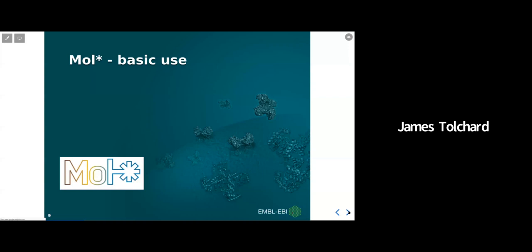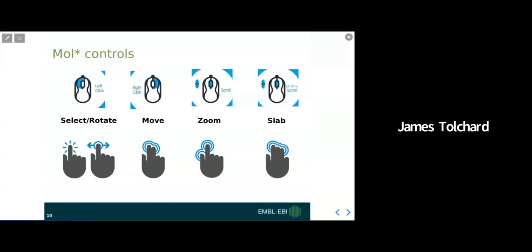Now we'll look at the basic usage of MolStar and show you how to load a structure directly from a PDBE entry page. Let's briefly run through the controls. To select and rotate molecules, simply left click and drag, or one finger hold and drag. To move or translate a selection, just right click and drag or two finger hold and drag. To zoom in on a selection, either use the scroll wheel or two finger pinch. And for slabbing, either use the scroll wheel with the shift key held down, or three finger holding and dragging on a touch device.